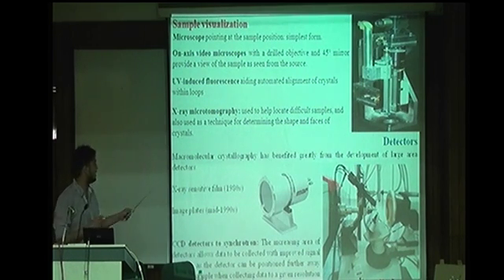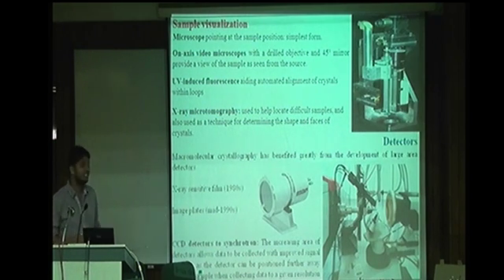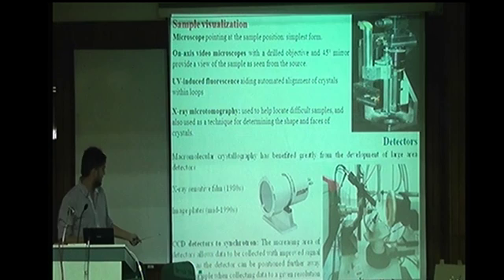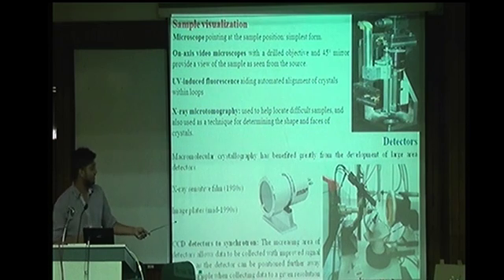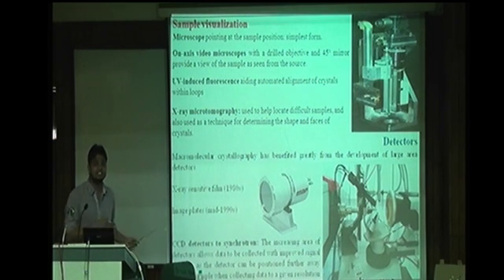Initially, in the 1980s, people used X-ray sensitive films, for which you again require a dark room to generate the films. Later it evolved, and image plates were in use in the mid 1990s. And now CCD detectors are in function at synchrotrons. The increasing area of the detectors allows data to be collected with improved signal. And the latest one is pixel array detectors, which are now being used in place of CCDs in certain synchrotrons.